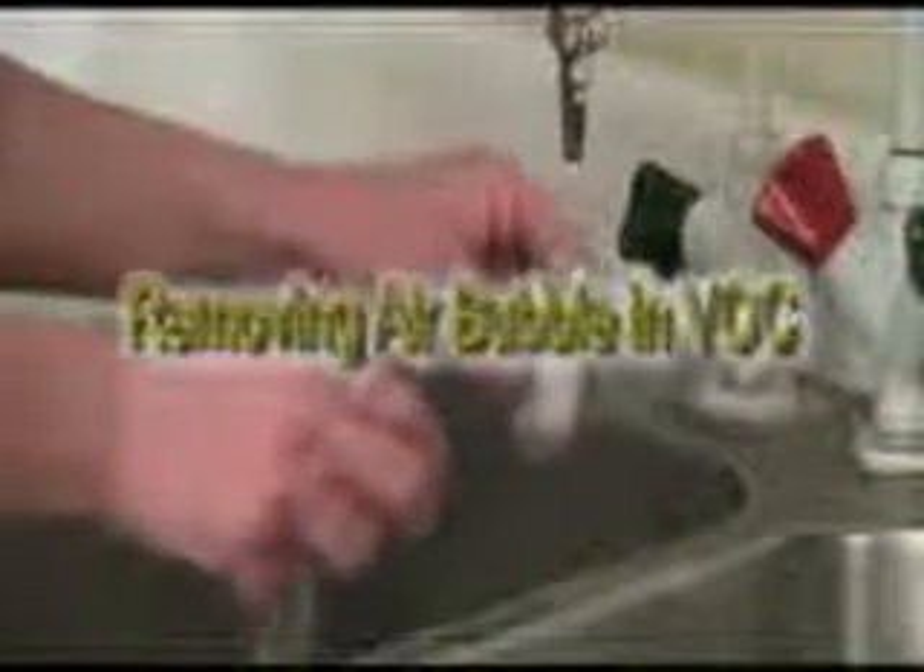After filling your VOC vial with sample, replace cap and turn upside-down to see if there's an air bubble. In this illustration, the sampler still has some air in the vial, which may cause the sample to be rejected. Simply take the cover off and carefully add some more sample so that it just overfills the top of the vial. This is called a reverse meniscus.